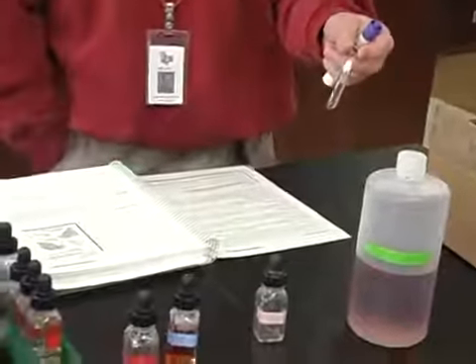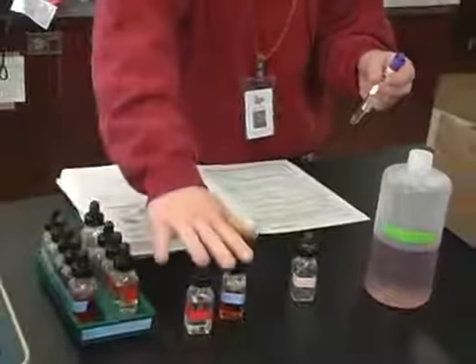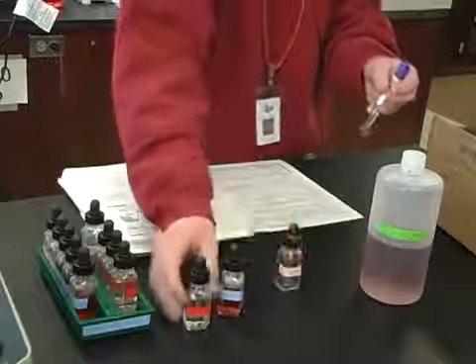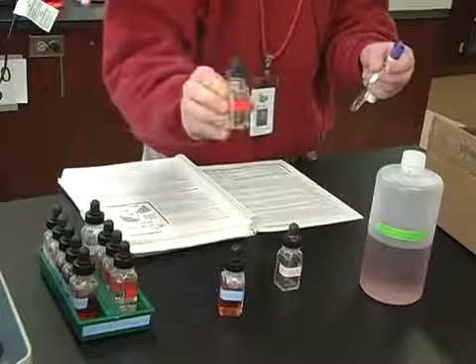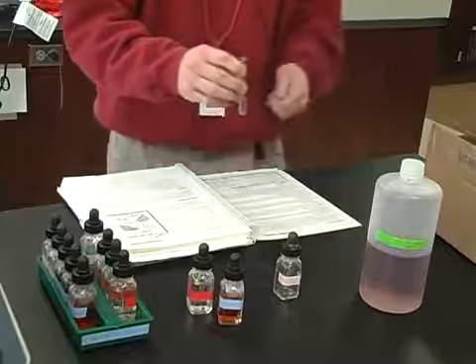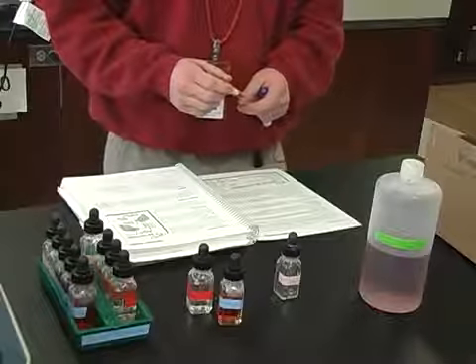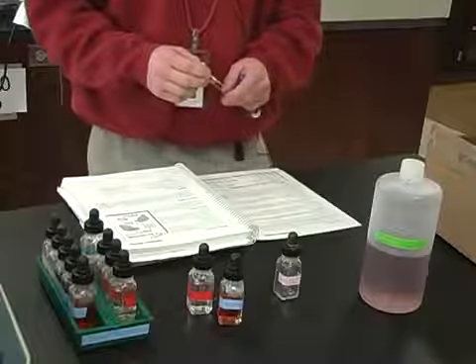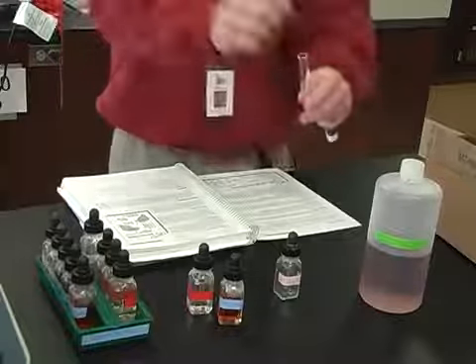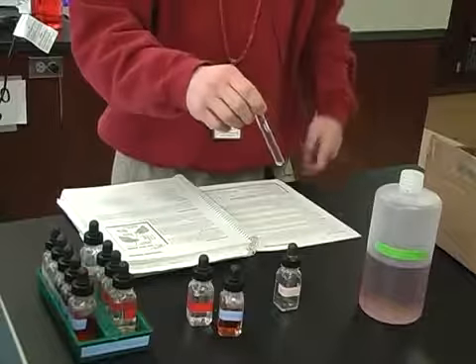Stirring solutions. Each time a reagent is added to a test tube, now each one of these little bottles right here is called a reagent. So the sulfuric acid is a reagent, the KSCN would be a particular reagent for some step. Each time you add it, it needs to be stirred. It's important to mix the solutions at the top and the bottom. A stirring rod sometimes helps with this. So take your stir rod, dump it in there, kind of swirl it up and down.